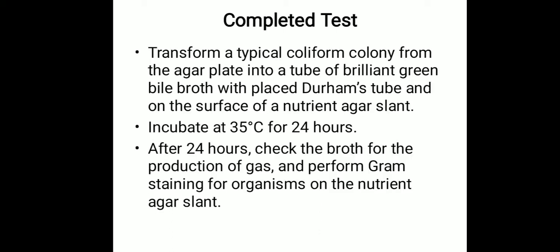Next we have the completed test. This test helps to further confirm doubtful and, if desired, positive confirmed test results. A typical coliform colony from an LES endo-agar plate is then inoculated into a tube of brilliant green bile broth and on the surface of a nutrient agar slant.